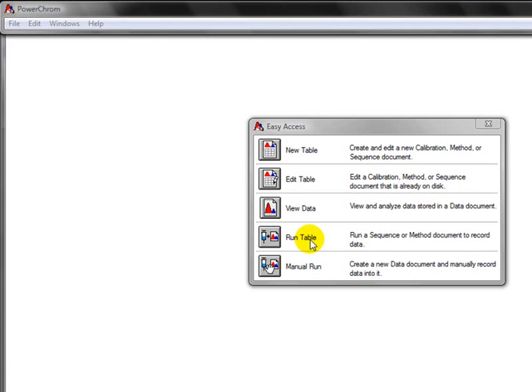The C4D profiler for PowerChrome software helps you to decide the best C4D settings for the background electrolyte which you are using. You should connect your C4D system to the computer and turn on the C4D system.